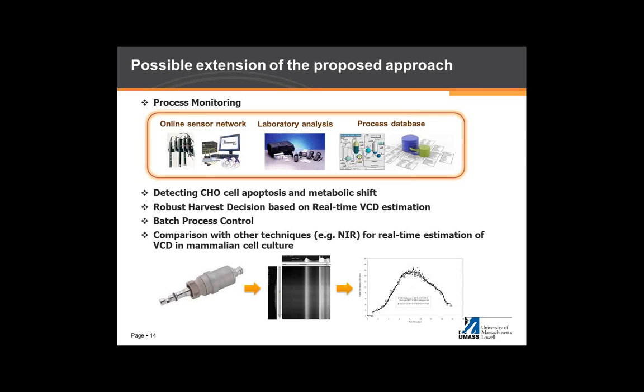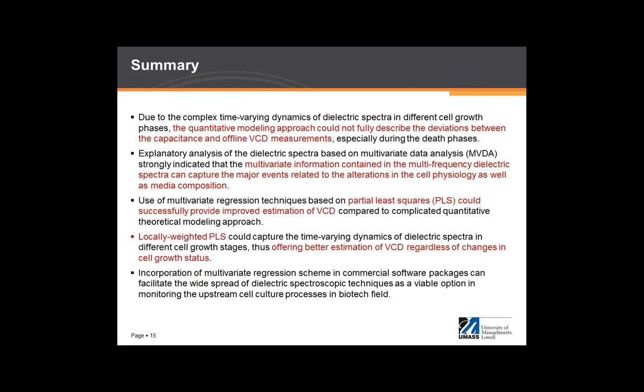But we see some complementary aspect between RAMAN spectroscopy and this viable cell density measurement based on the capacitance value. So that's the current research topic we are conducting.